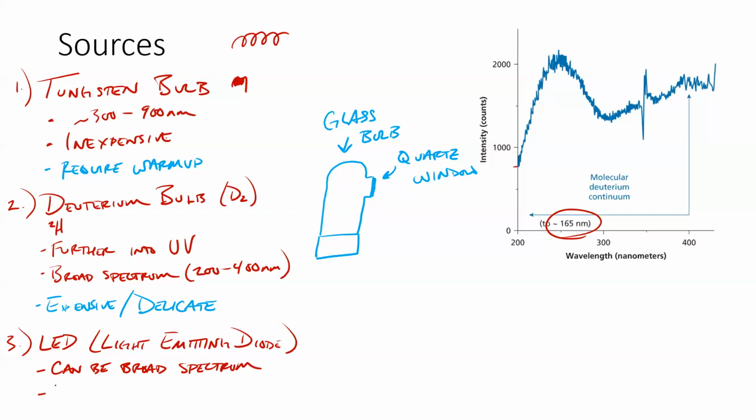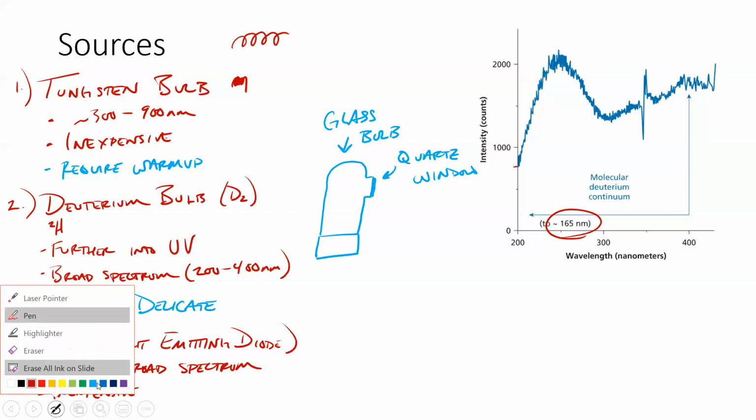They're even less expensive than tungsten. And really the only drawback for LEDs is in terms of power stability.